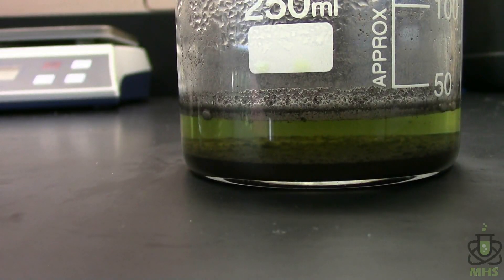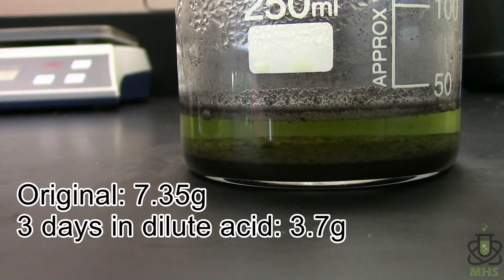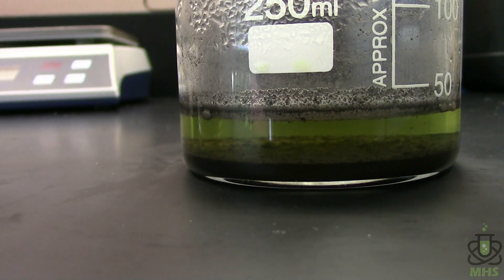After leaving the products under dilute acid for about two or three days, I filtered it off and dried it — the weight had decreased from 7.35 grams down to 3.7 grams. Theoretically we should only get 1.25 grams of boron maximum from what we started with, and clearly there are lots of side reactions, so I don't expect to get anywhere close to that amount. We want the acid to keep working until we get at least under 1.25 grams, which is hopefully the target.